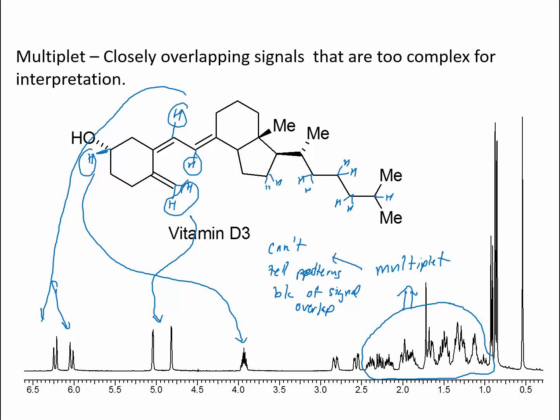Let's see, what are these two? I'm not sure here, but I'm guessing that they're probably these. Okay, this methyl group here is going to be a singlet.